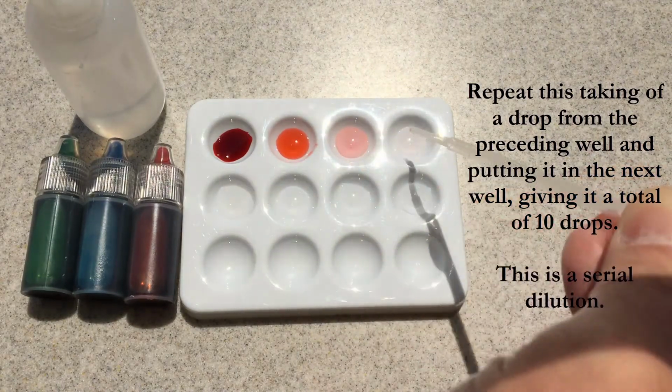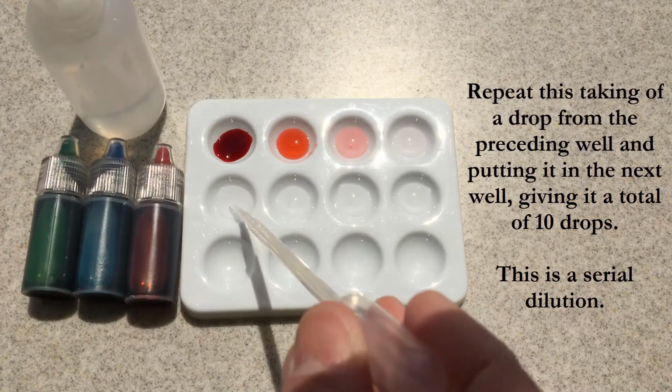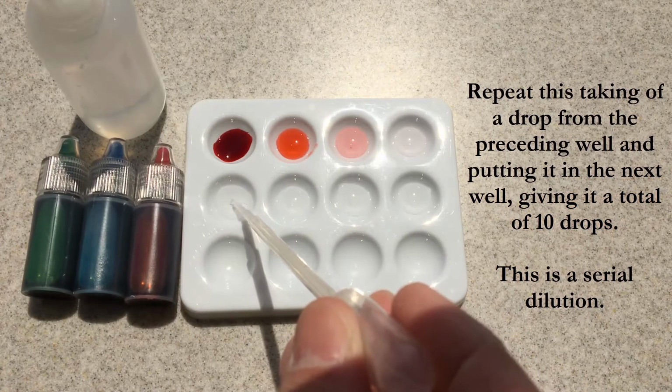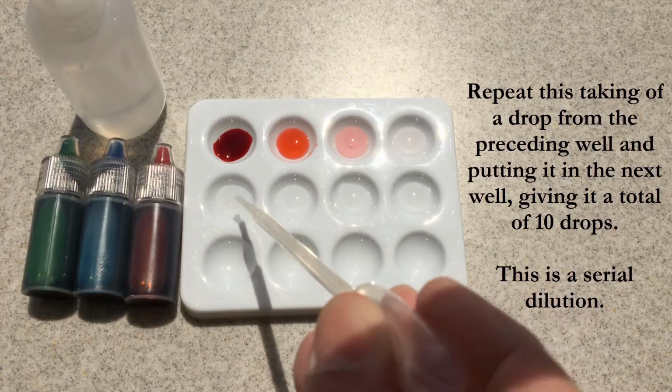Now you'll notice that obviously it's been diluted. This is a serial dilution. And eventually you won't be able to see any red dye, or blue, or green.